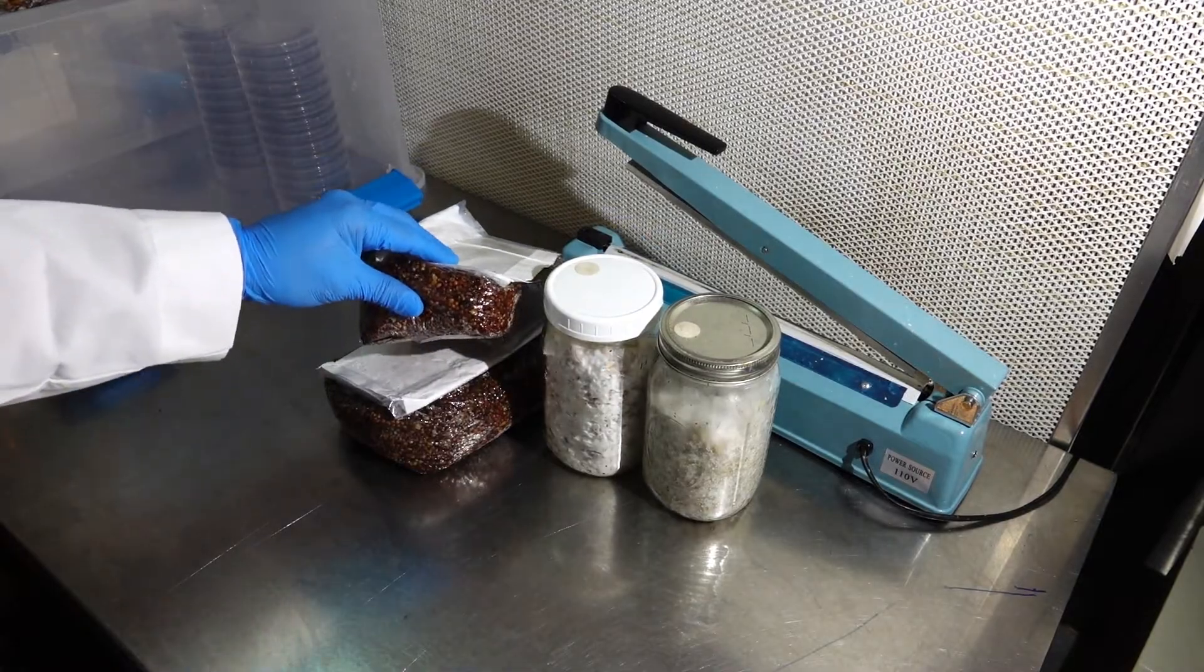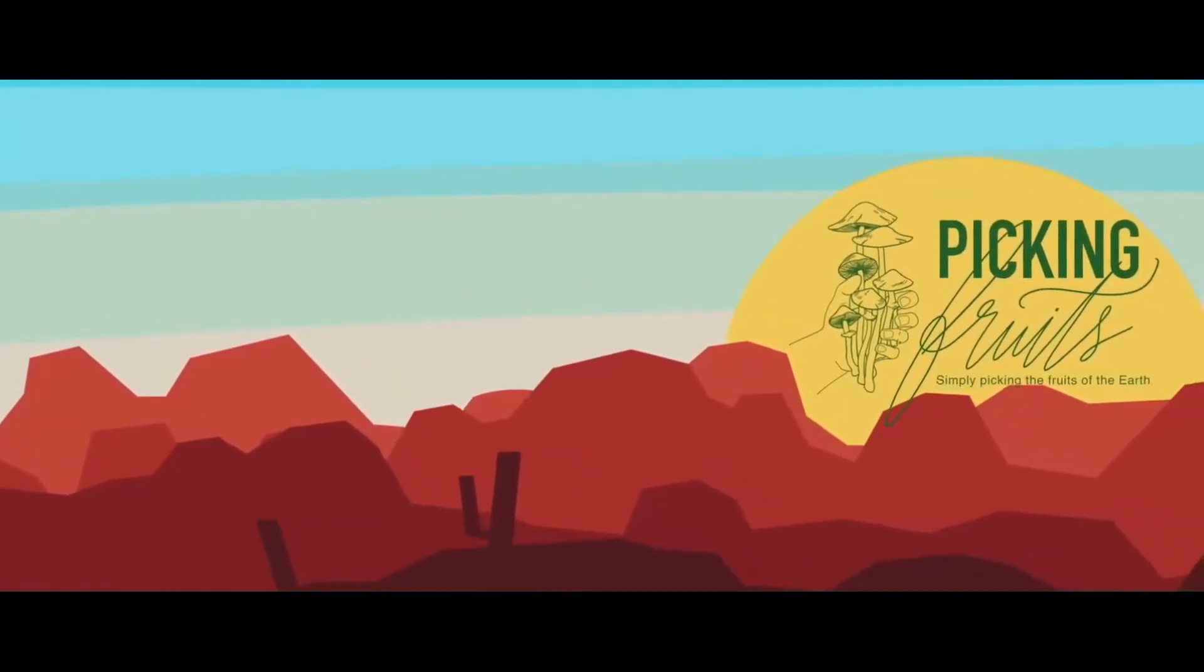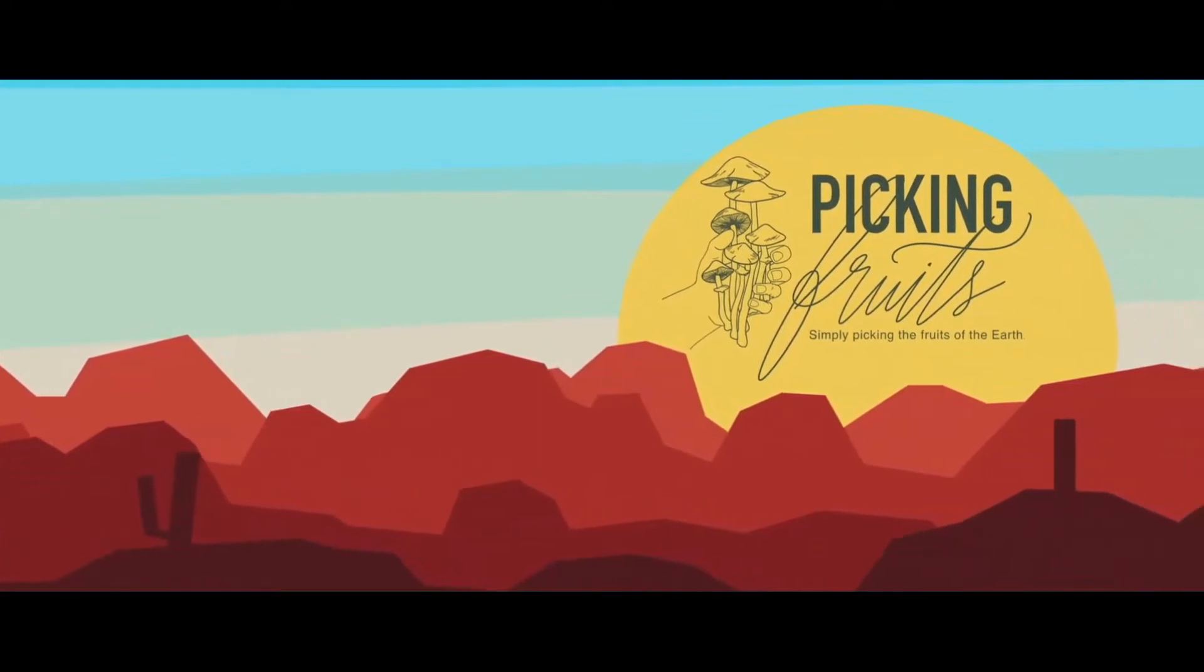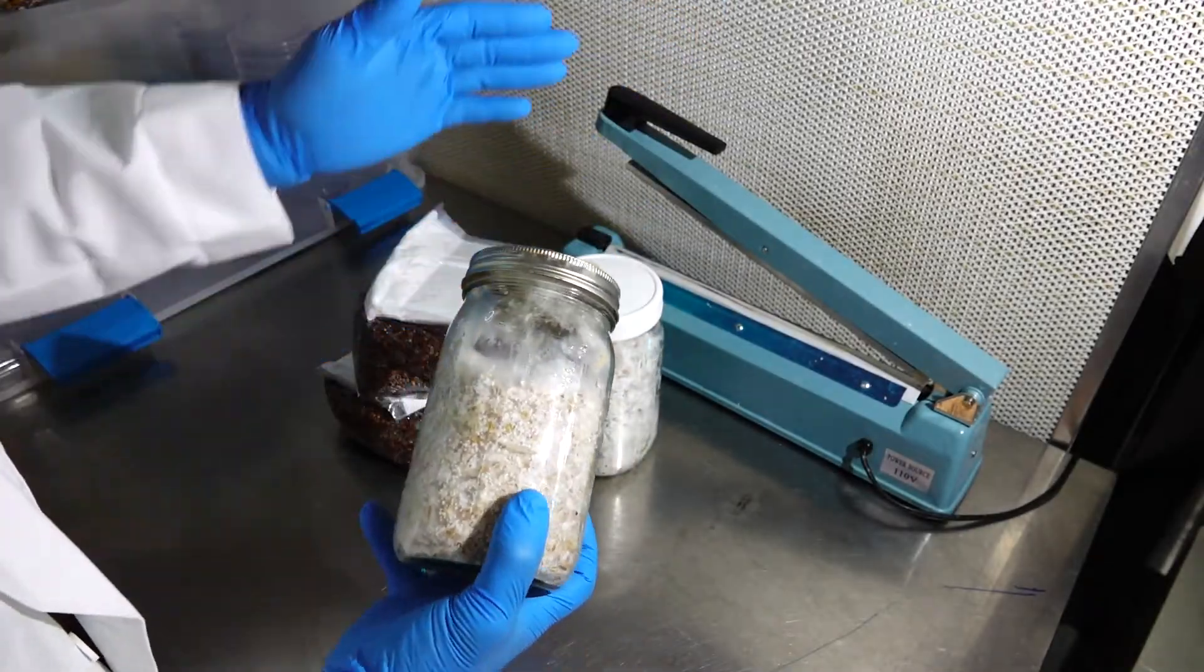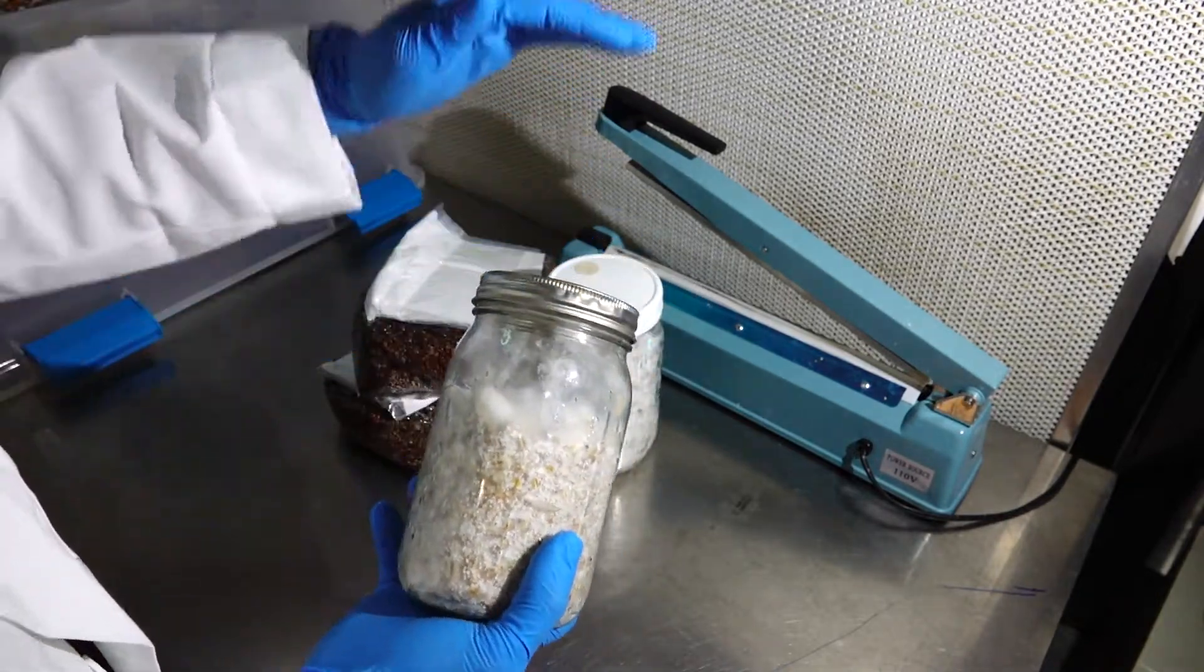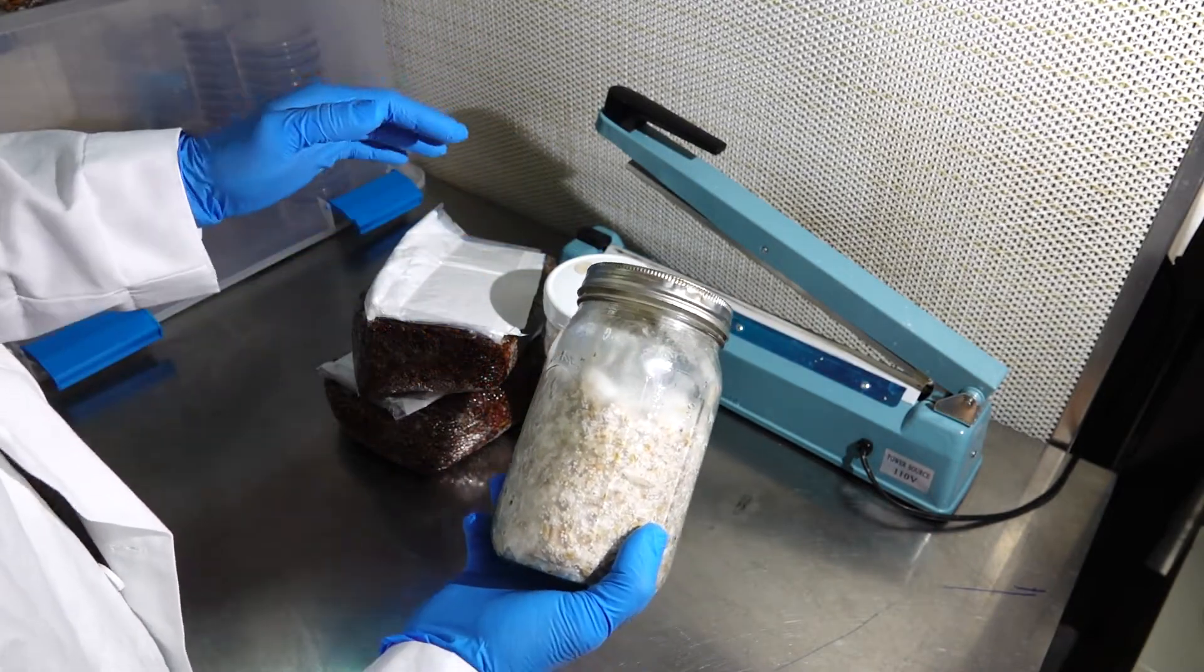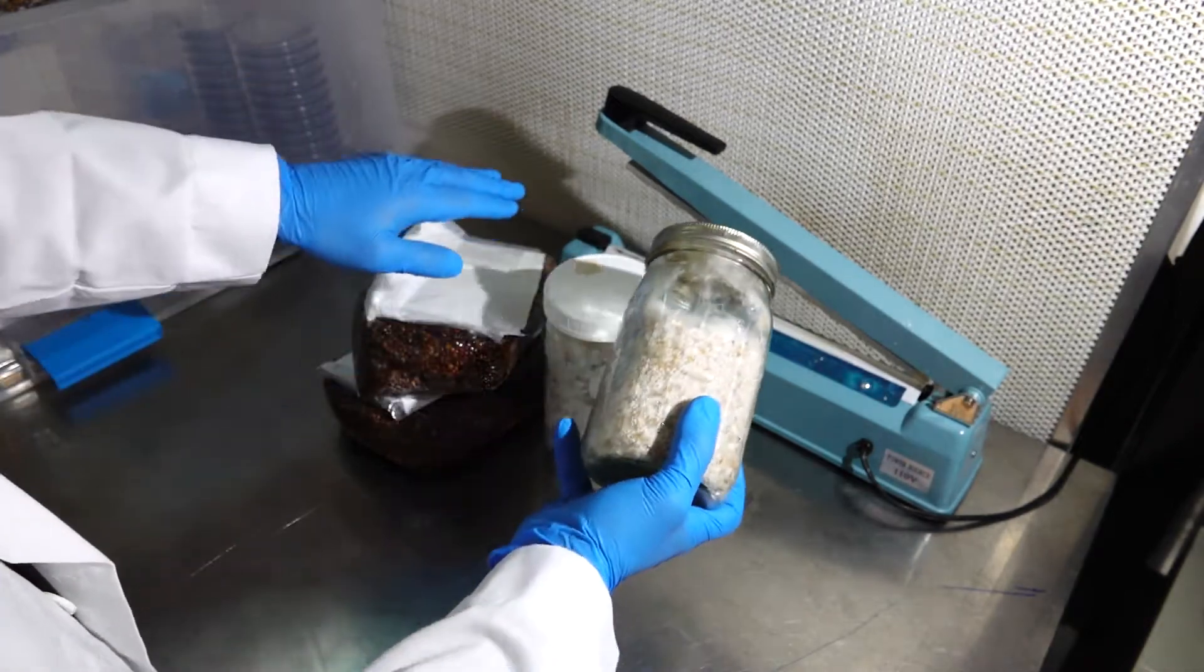If you have access to a flow hood, that is the most ideal way to prevent any contaminations. If you do not have access to a flow hood, you can easily make a SAB or still airbox at home using a plastic tub, drilling out some holes for your arms to fit into.